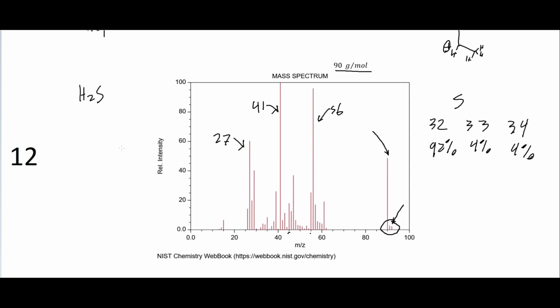So this again is probably going to be a butyl, and I think you see the pattern here that all of these are butane backbones. You could just determine that based on the size of the fragments here. So this 56 being close to our 57 butyl fragment, and we don't have any significant fragments after that, is a good indication that the butyl is our largest alkyl group.